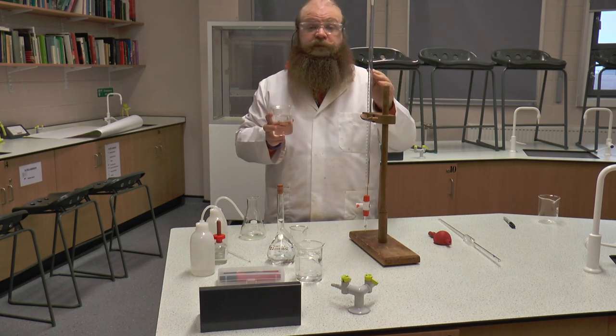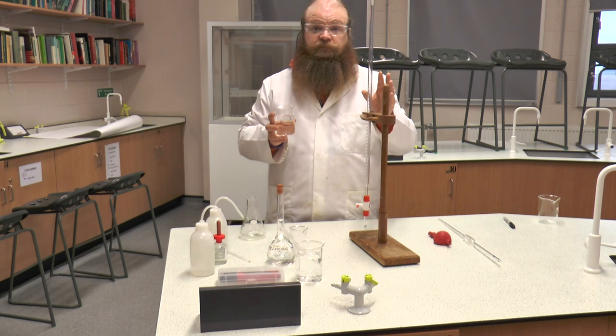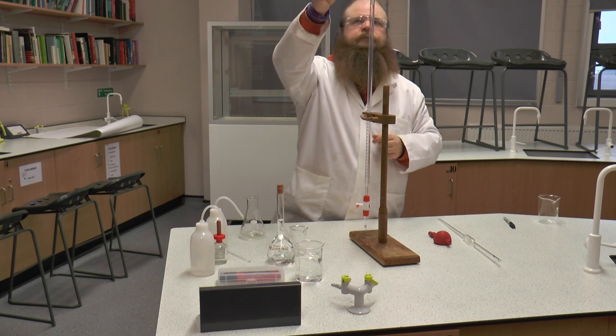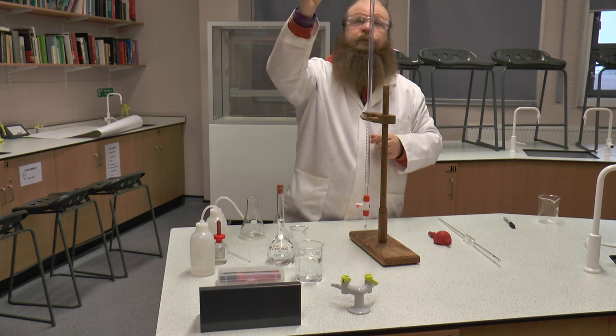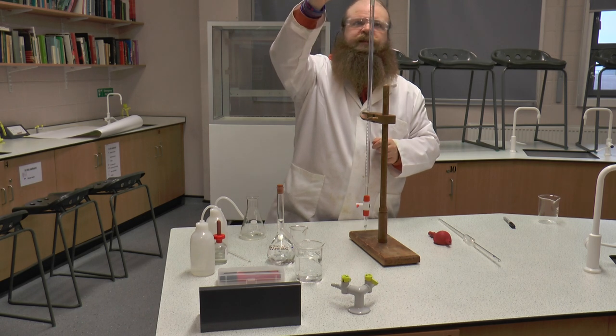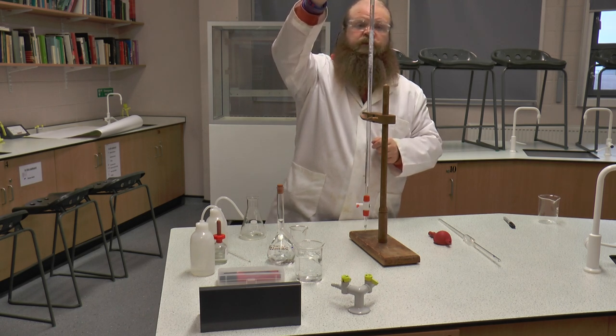If it's above or slightly below zero, it doesn't matter, because we're going to be able to work out what that starting point is. So I'm going to pour out our HCl, having made sure that the tap at the bottom of the burette is shut, so that we do not get hydrochloric acid all over the bench.